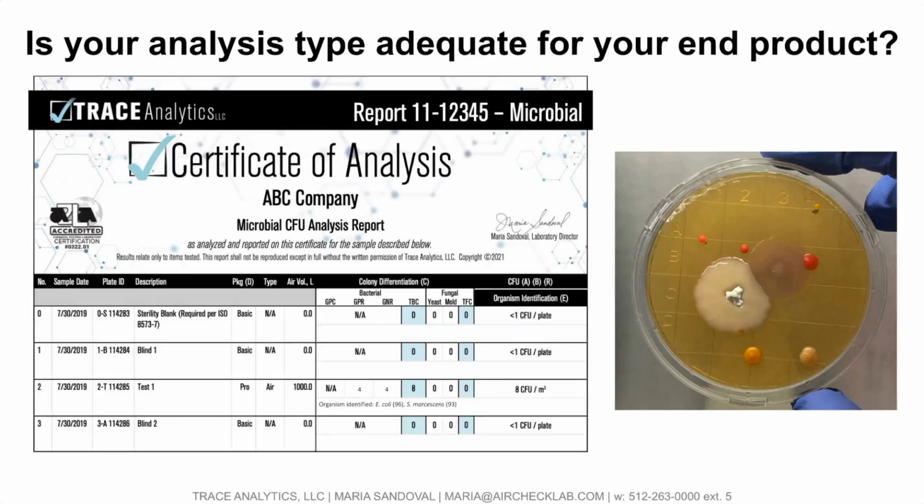So let's say in this example, we have 4 gram-positive rods and 4 gram-negative rods. And from there, we did Biolog analysis, and we found that we isolated E. coli and we isolated S. marcescens, right? And so those numbers next to the organisms is a quality value. It's a qual value. It's my confidence. The laboratory who saw this is 90%, 96% sure that we've isolated E. coli.